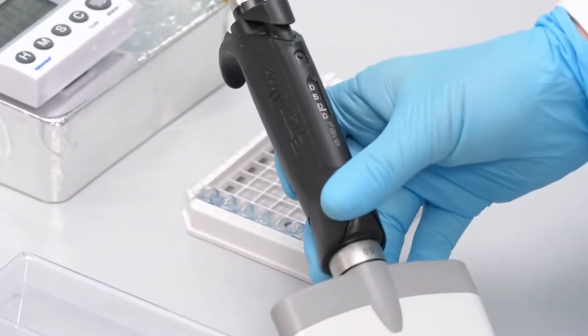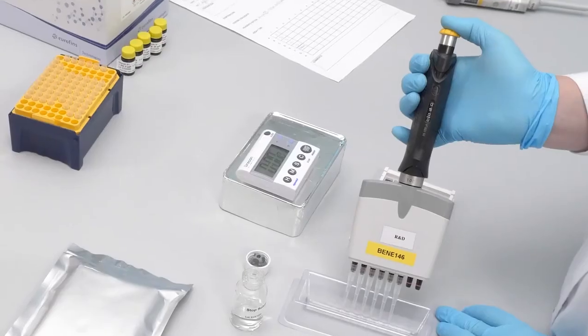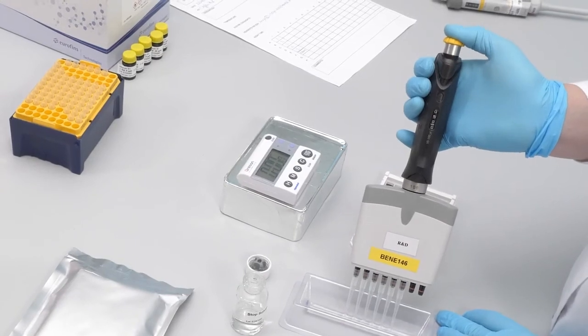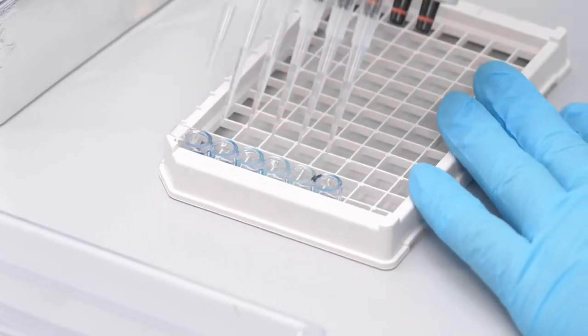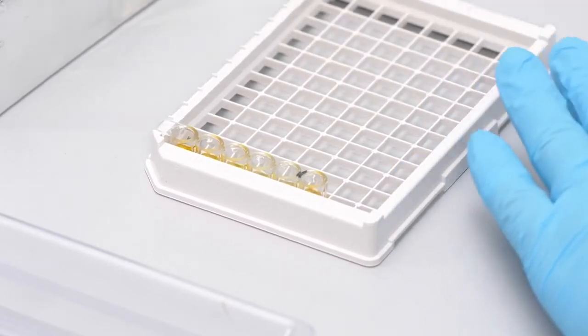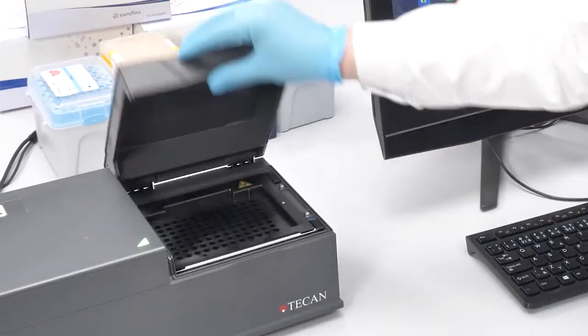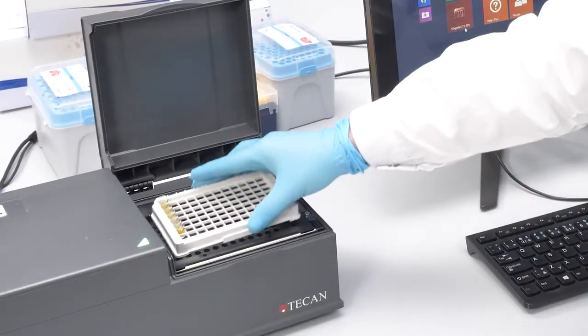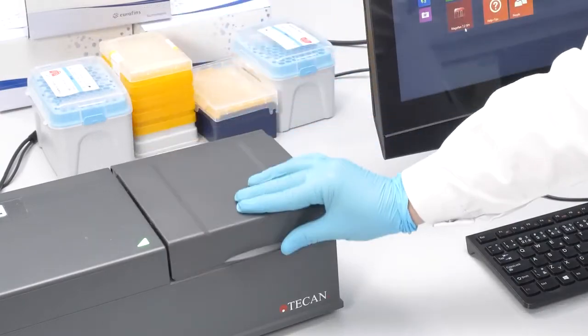Add 50 microliters of stop solution in each well. Gently shake the plate for a few seconds. Measure the absorbances at 450 nanometers within 15 minutes.